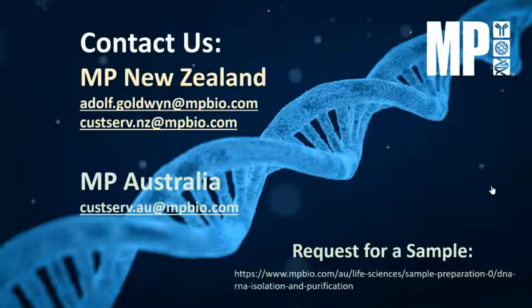Yes, that's a good question. In fact, that's a very common challenge when we are working with fecal samples. One of the suggestions I would highlight is protein removal. We have to ensure that the protein removal process is done well, and that at the inhibitor removal step you have a well mixed solution. If needed, you can also keep your samples in the fridge for another 5 minutes. That comes from our own kit troubleshooting. We can cool the sample a bit to make it precipitate more, such that you can precipitate more of these contaminants for some of the tougher samples.